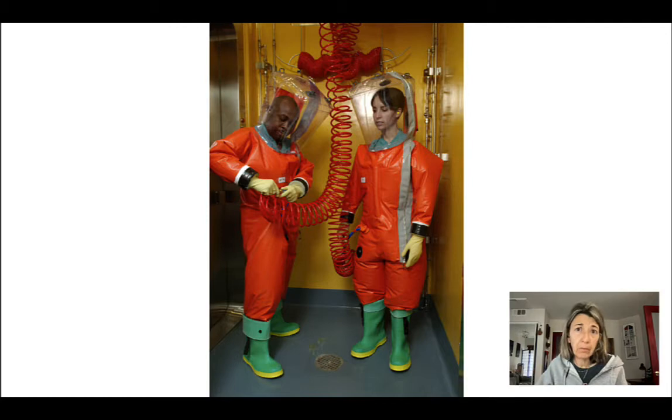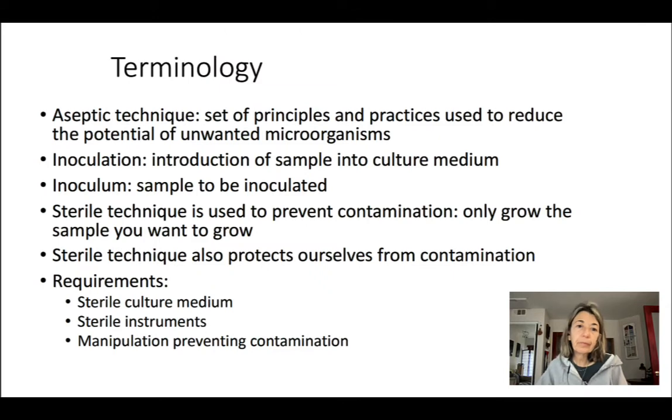So I recommend that when you do the biosafety simulation, really follow the steps that are being told, because otherwise you may die, or your co-workers may die in the simulation. You will see a number of very repetitive, very scripted steps, but the reason is obviously to prevent accidents or contamination. Okay, so let's move on now to aseptic technique.